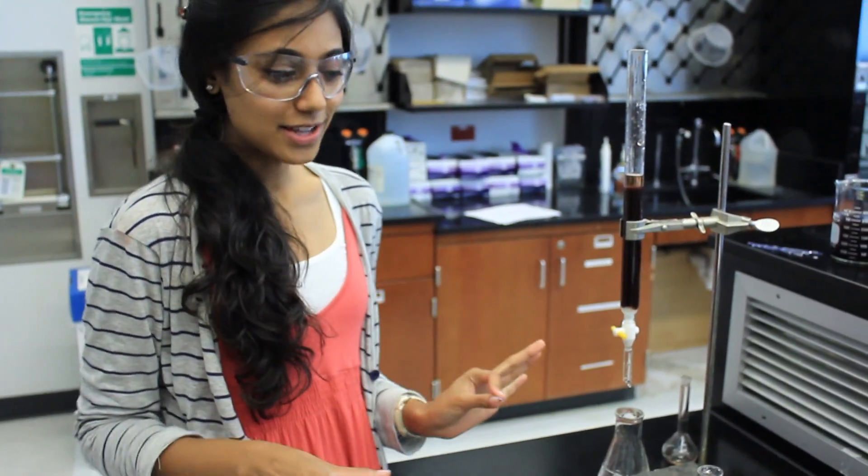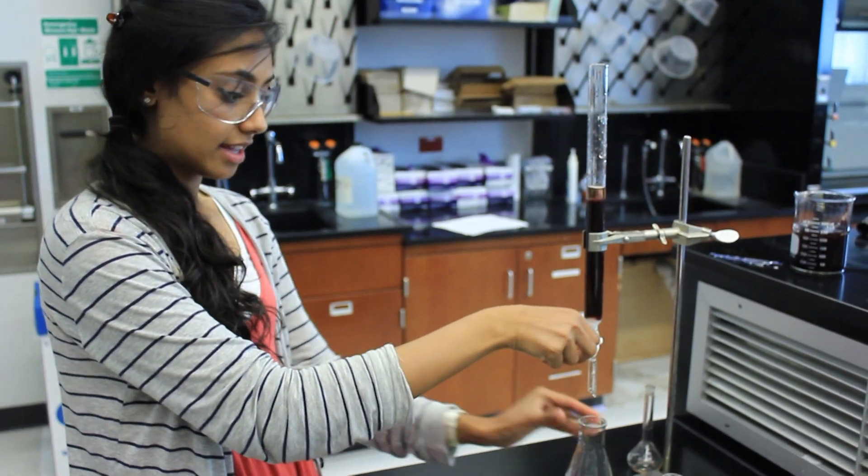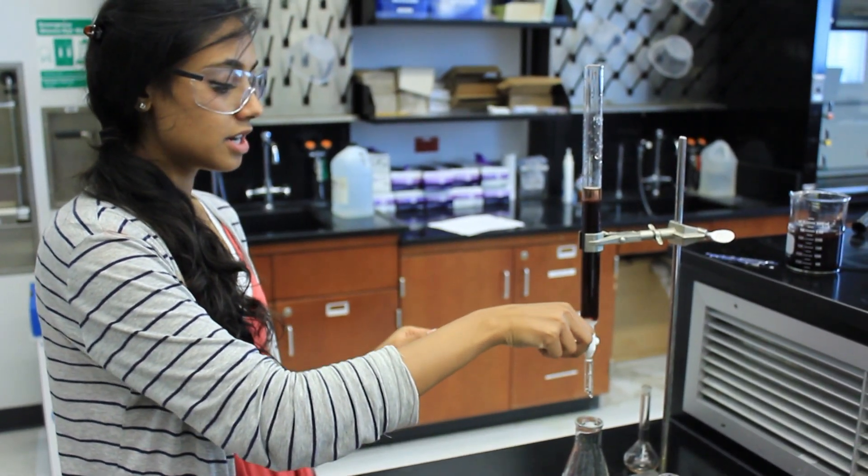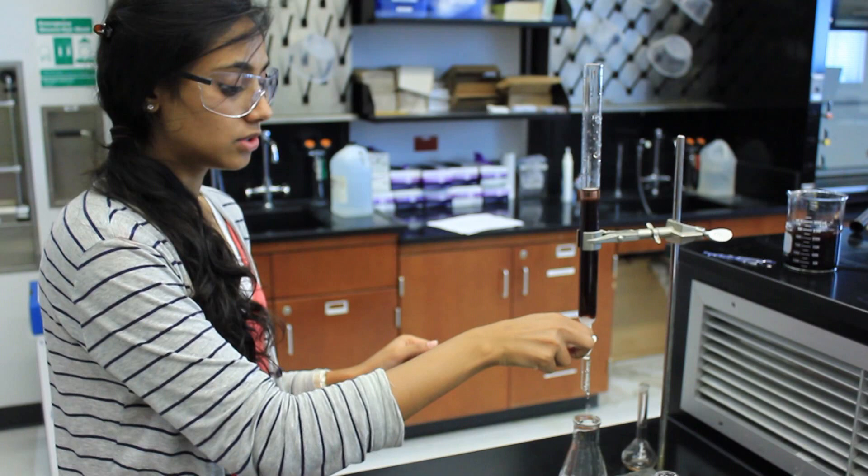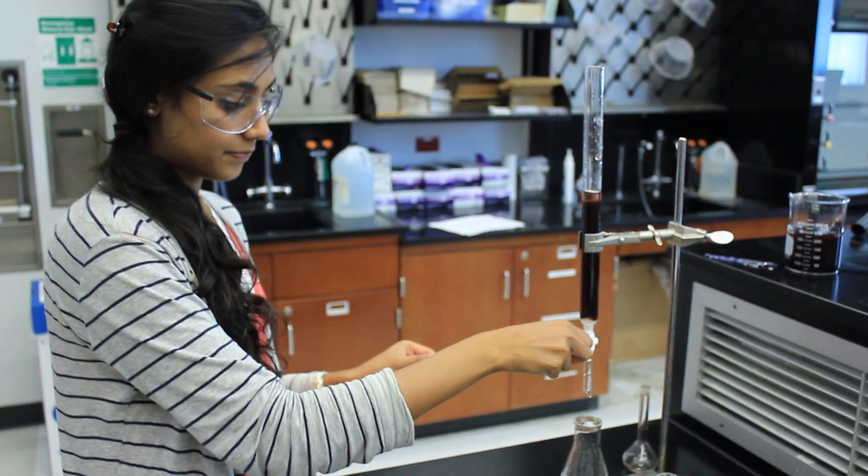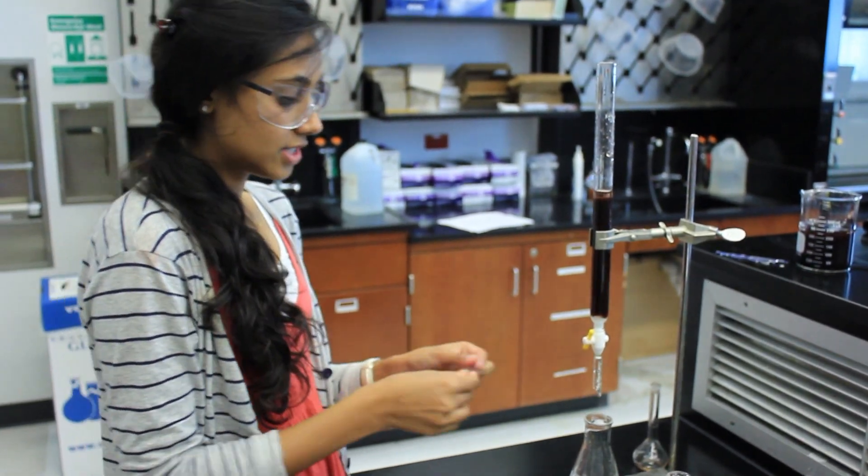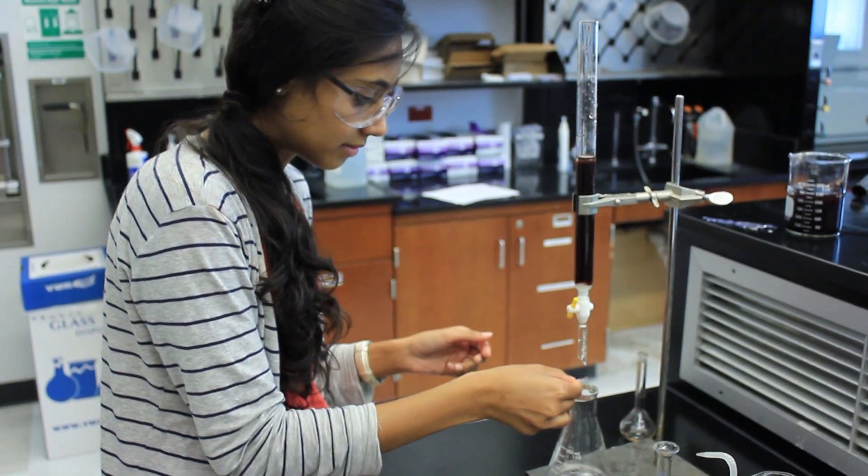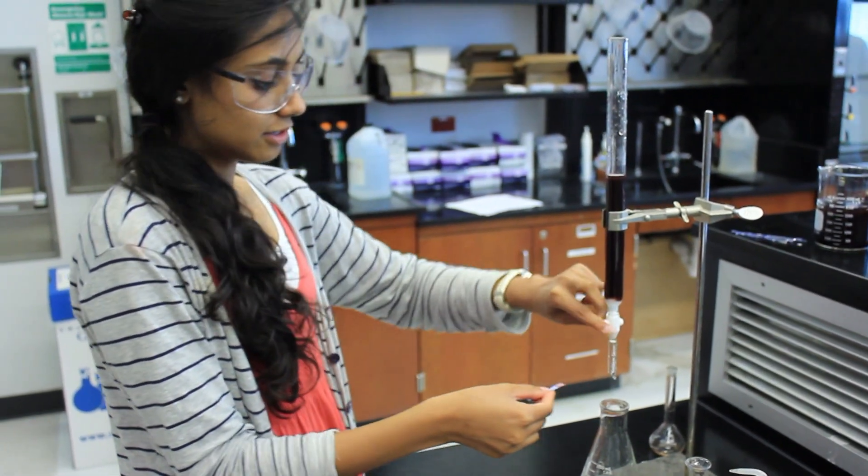Now we have to wait for the effluent to become neutral again. So make your column drop at a rate of two to three drops per second. And just take your litmus paper and test it really fast.